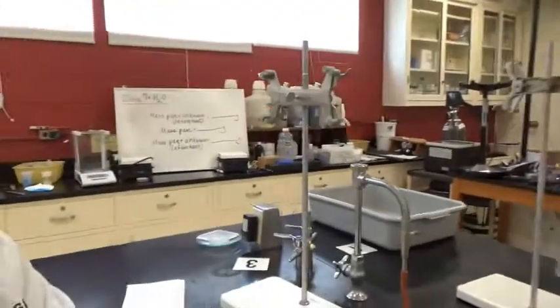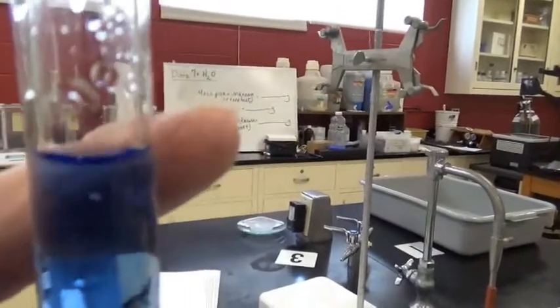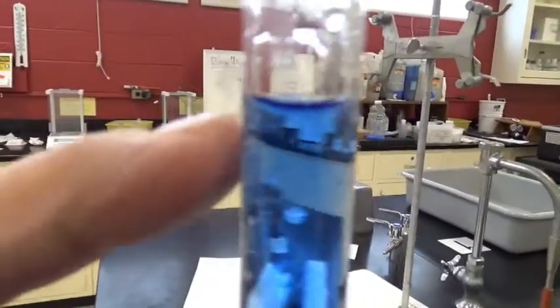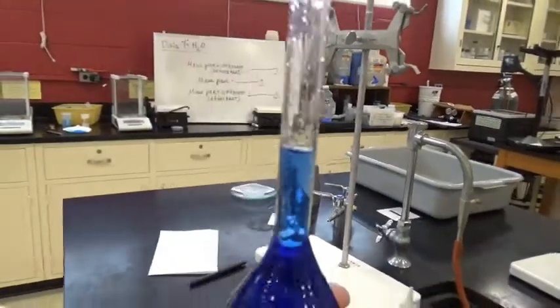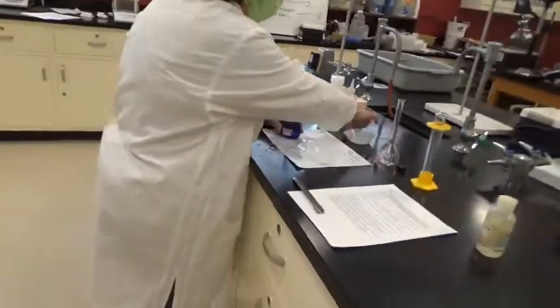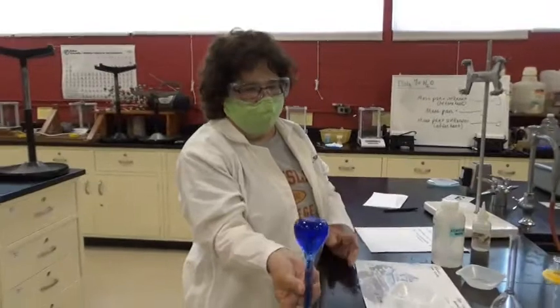I'm not good at this. It's kind of hard to see. So it should be resting right on top of that mark that's on the flask. All right, not bad. Now what I'm going to do, I'm going to invert it 10 times.